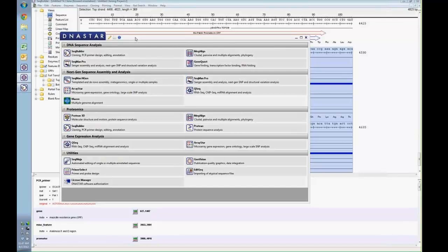So if you know that at position 10 in this specific case of the wild type you're looking at, there should or should not be an ambiguity or a difference or a SNP, this will show you that in the report. I can also double-click on any of those entities, and it'll lead me directly to that alignment view where I can confirm this. Maybe it's a sequencing artifact, or maybe it is a true SNP that you may want to evaluate further. There's also codon usage information, and how far it is in terms of codon distances.